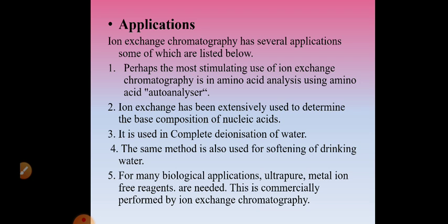Amino acid analysis is generally done by using an amino acid autoanalyzer, which makes use of ion exchange chromatography to determine the amino acids present in a protein.